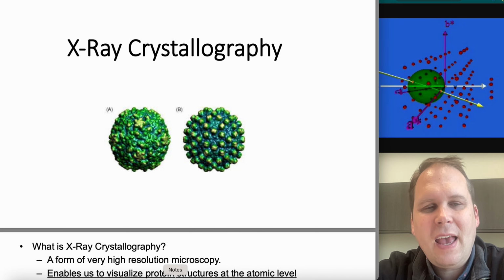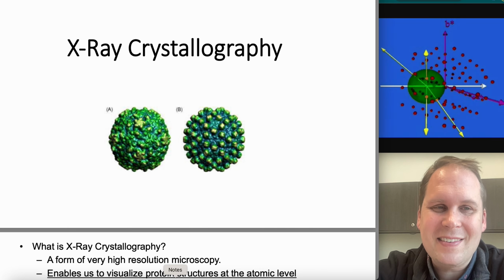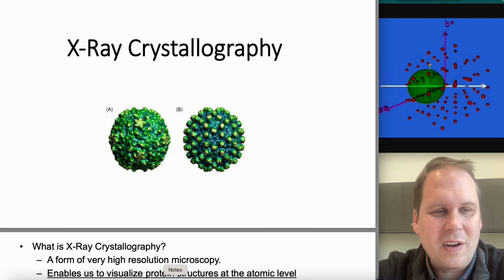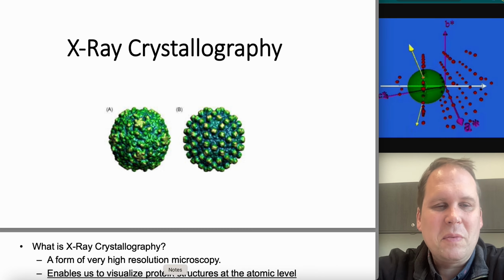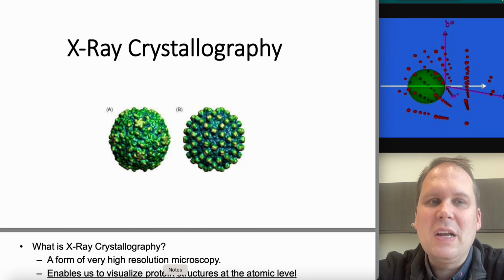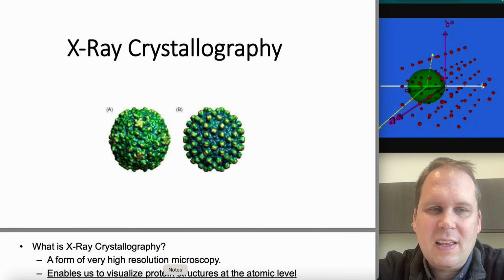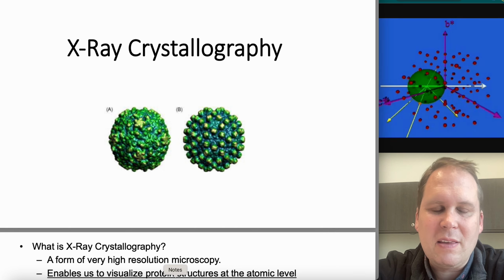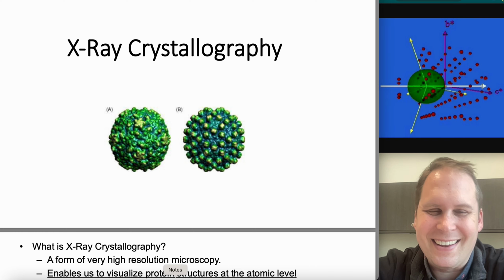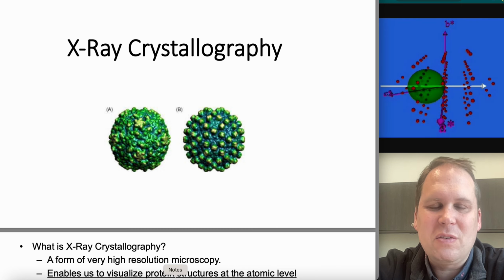So we had in the database a lot of crystals of a few relatively easy to solve things. And for most things, we had just no crystal structures. But over time, we've had a couple other methods come along. NMR, nuclear magnetic resonance, is a really good technique, but it's very difficult to fully solve proteins that are longer than maybe 300 amino acids. It's already getting dicey. You might be able to get to 500, but you won't like how you get there. Larger proteins are just too difficult to solve.